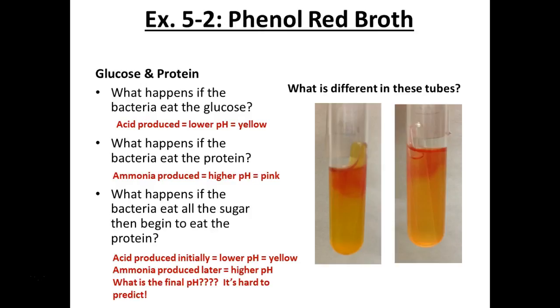They always choose sugar. It's fast energy, right? It's much more work to break down proteins. But some of them don't ferment at all, right? Yours went right to protein. Yeah, protein first. So this one would be coded acid, no gas, weak K, where this one would be acid, gas, weak K. So there's actually some of you guys that think you're just this, but you're actually this, because it's going to turn pink. So we'll look at those again.